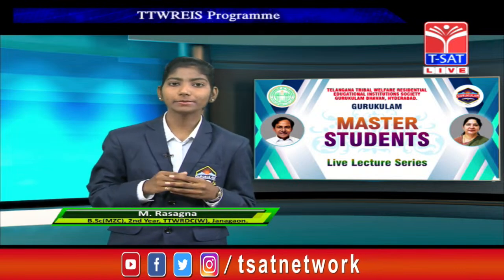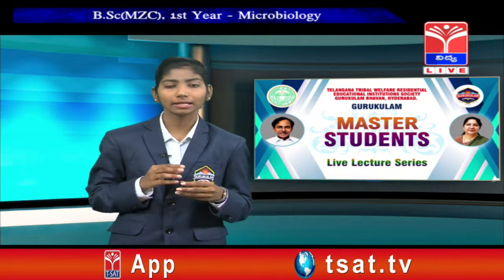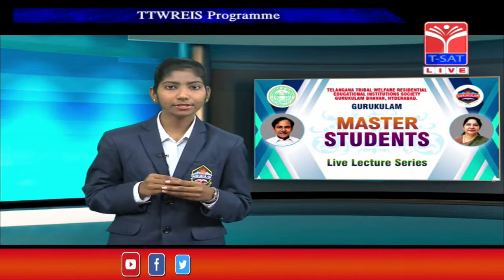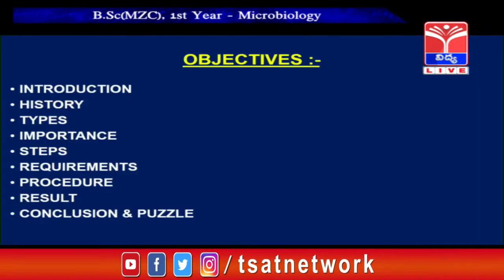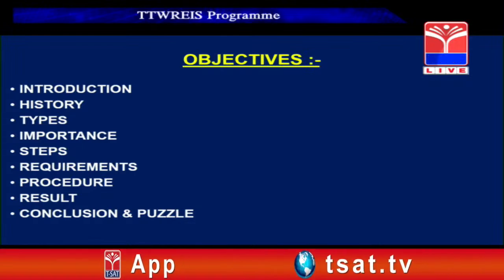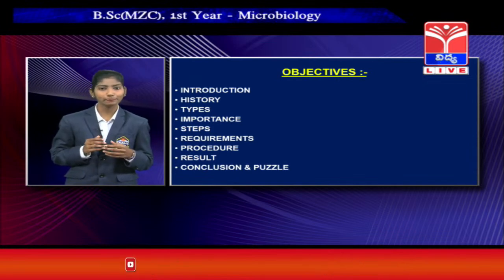So, my subject is microbiology, and in microbiology my topic is gram staining. The main objectives of my gram staining topic are introduction, history, types, importance, steps, requirements, procedure, result, and the last one is conclusion as well as a puzzle.